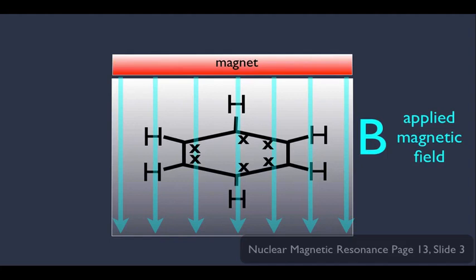And when those electrons circulate around the ring like this, remember, we just learned that when electrons move, they create magnetic fields around them. So notice that dark blue arrow there. Let's pretend that's the magnetic field that those electrons are creating. And let's focus on these hydrogens here on the left in the yellow box. Notice how the magnetic field created by the electrons is moving right through those hydrogens.